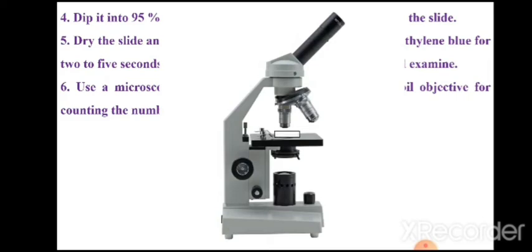So under the microscope, place the slide such that the objective touches the marked area of 1 centimeter by 1 centimeter.